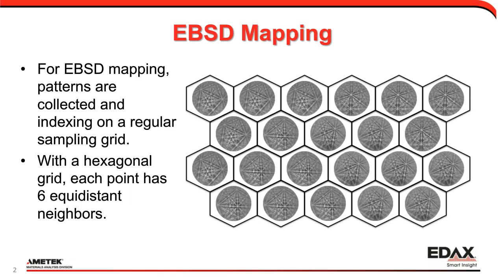That is very important when you're doing these kinds of maps, because then every data point, the center, is always the same distance from its neighbors' centers. If you do a square grid, you don't get that, and your data can actually be biased because of that. This hex grid is important for NPAR, and I'll go ahead and talk about that.